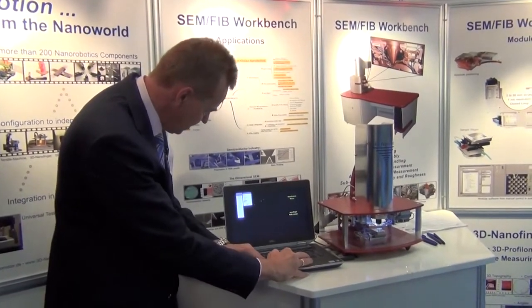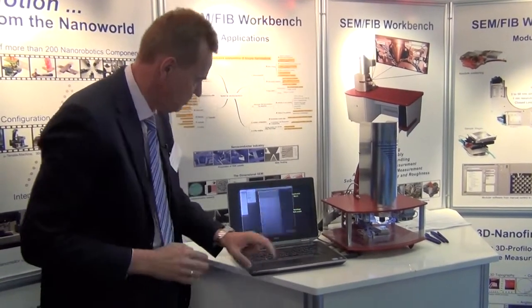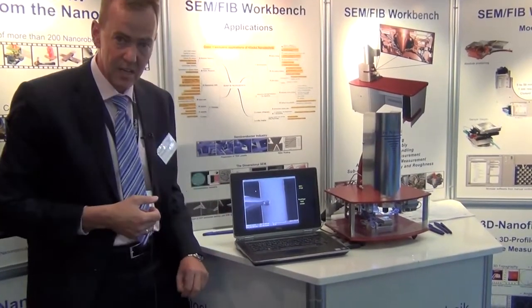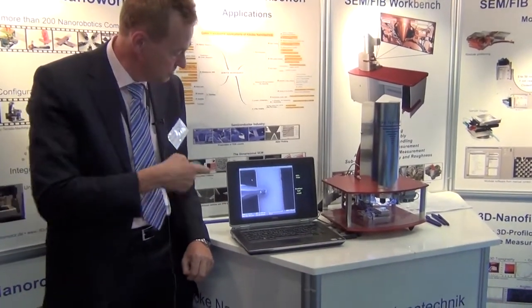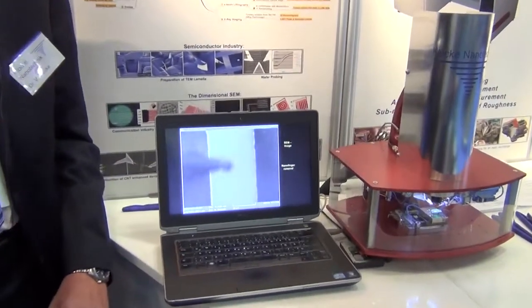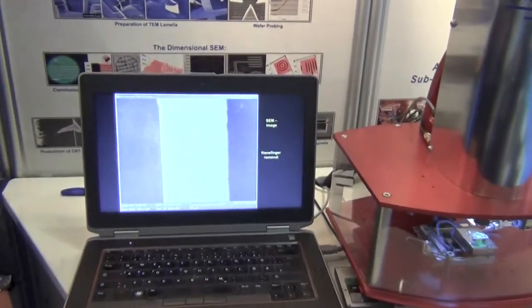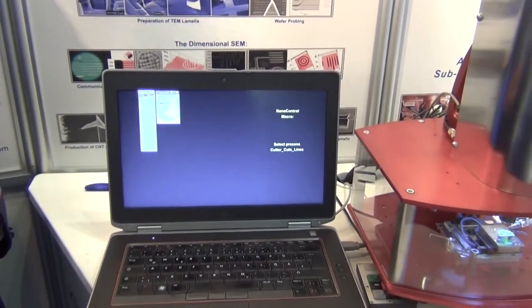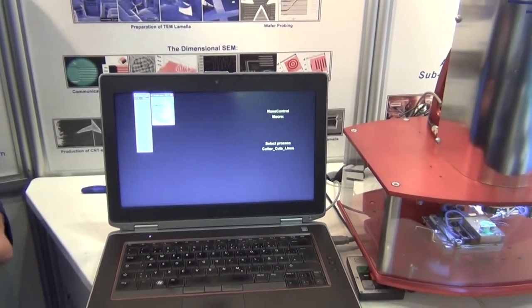You have an empty screen and you select the macro out of the list. This macro is called nanofinger finds sample. So at first, here's my sample. The nanofinger comes automatically into the field of view, detects the height of the sample and moves back again. Out of the field of view, nothing has changed except that we now know where the sample is.